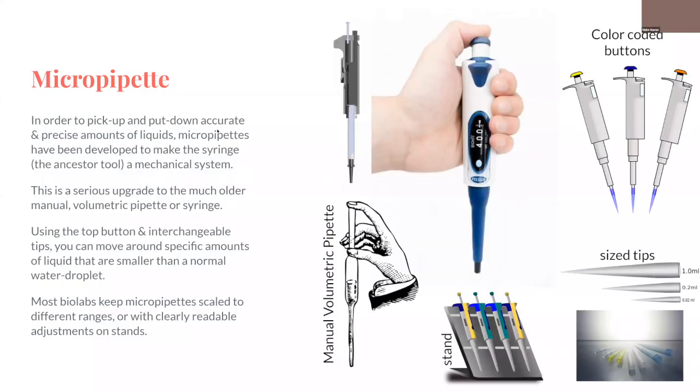Part of the tools that you'll need for that is a micropipette. And so we have 4 good ones, 3.5 good ones, one that's seen a full life. These tools are the core skill of most of the bio room. There's old school pipettes like this, where you've got a big vacuole here, and then there's this fun animated GIF of how they work. But ultimately, it's a tool that lets you dish out a very specific amount of a liquid. That's it. That's the short version of what it does.